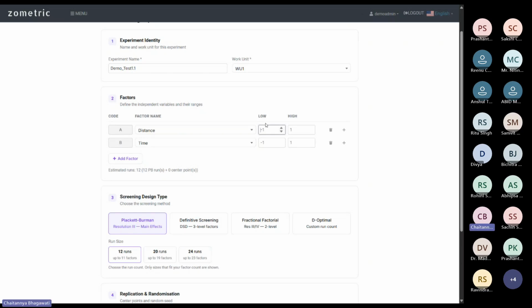Now, any bounds you may want to add? Simple numeric, suppose 4 meters to 10 meters. Yep, 4 meters to 10 meters. And time would be 15 minutes to 25 minutes. Okay, I had configured it as seconds, but that's fine. I'll just put it as 15 seconds and 25 seconds.